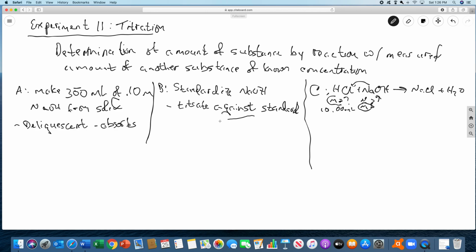There's a whole bunch of them, but the standard we're going to use is oxalic acid dihydrate. So it's a hydrated solid, and it's a solid acid, which means you can get very good precision. Make sure that you use this molar mass in your calculations. Just to help you with that, this is about 90, water is 18 times 2, 36, and 90 plus 36 is 126. And the idea here is that you'll take oxalic acid that we have weighed out for you.